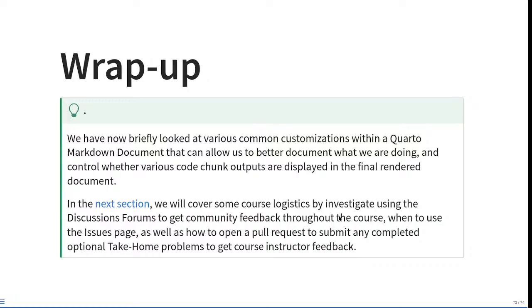So the remaining pre-course walkthroughs that we still have to get through are the one covering how to get help, as well as the Floreada tutorial. I don't have time to work with those today, so I'll circle back to those at some other point in the week. At this point within the pre-course walkthroughs, you have all the main portions that you'll need on a regular day-to-day basis for the rest of the course.